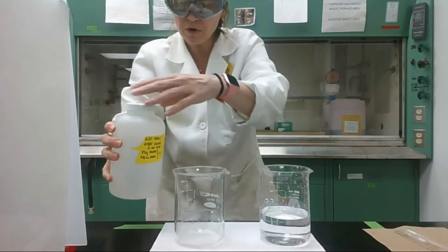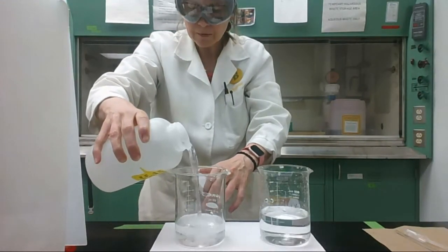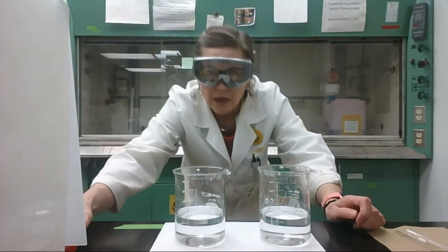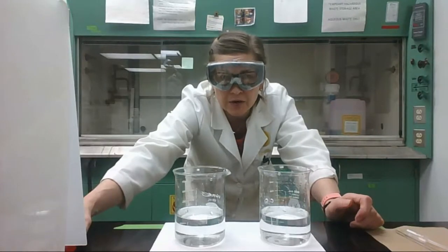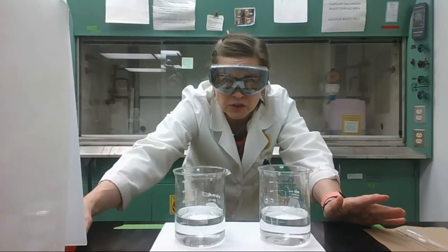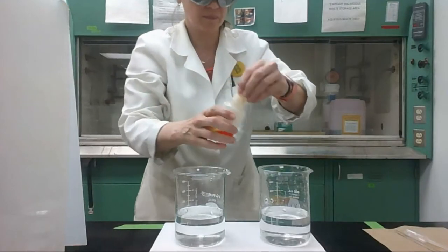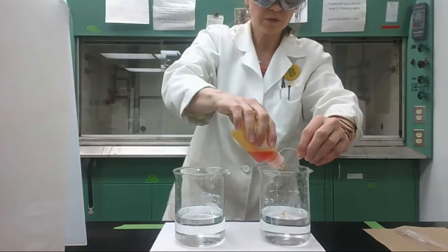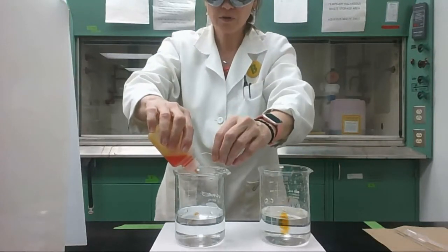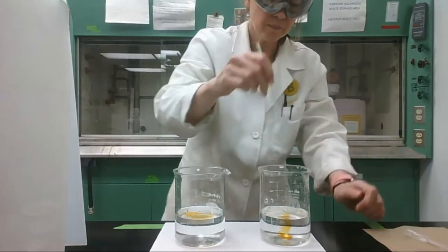So I'll again pour roughly 250 mils, just like the water. And now I'm going to add methyl orange indicator to each beaker. Methyl orange is usually yellowish under basic conditions, and then it turns pinkish or red under acidic conditions. So maybe 5 drops to the water and 5 drops to the buffer. And let's give these a little stir.